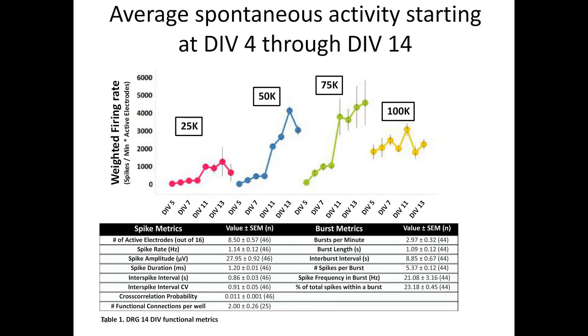The spike rate, once we do the actual spike sorting, they fired about one hertz, so they're not firing at high rates like you might see with hippocampal or cortical cultures.